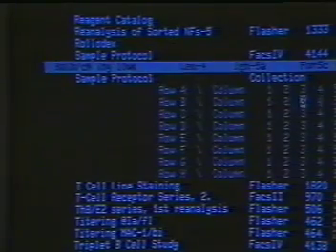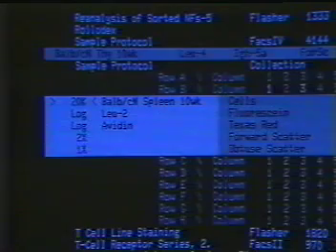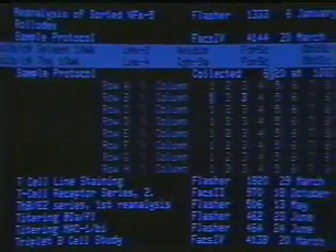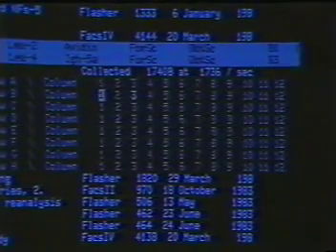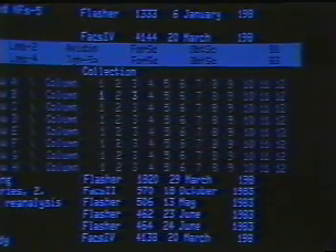Now we press Execute to view the label for sample B1. The machine conditions are already set for this label, so we simply press Execute again to begin collection. During data collection, the screen is very active. Arrows flash by the gray line for the sample being collected, the cursor flashes at the sample position on the matrix, and at mid-screen the magic secretary flashes a running total of how many cell data points have been collected and informs us of the rate of data collection.